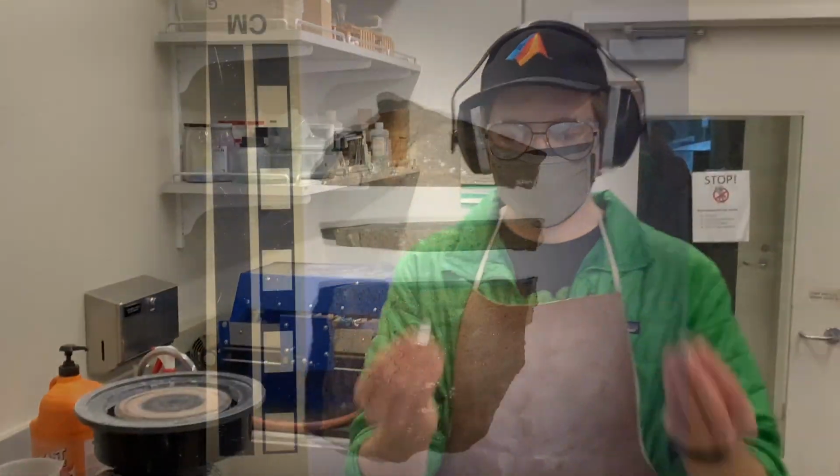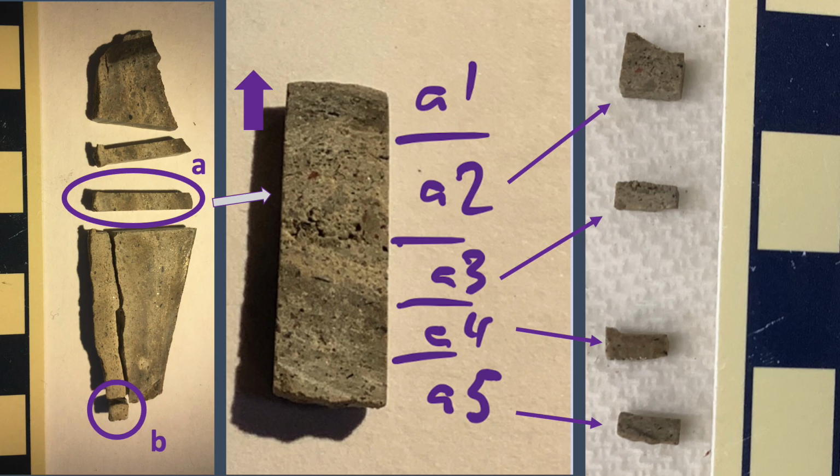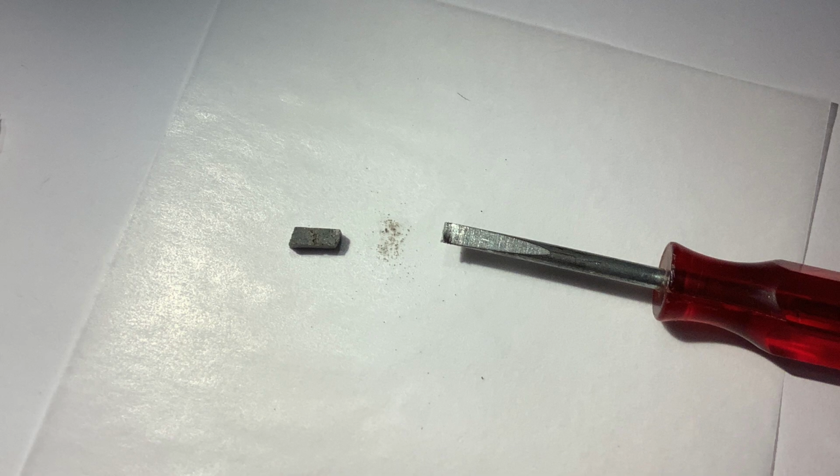And that's it. After sawing out a cross-sectional slab, we then cut out a column of the sample. We take a piece of the bottom layer, which we will call B, and subsample the upper layer A into 5 sublayers, going from A1 at the top to A5 at the bottom, just before B. We can accomplish this subsampling either with the rock saw or with hand tools.